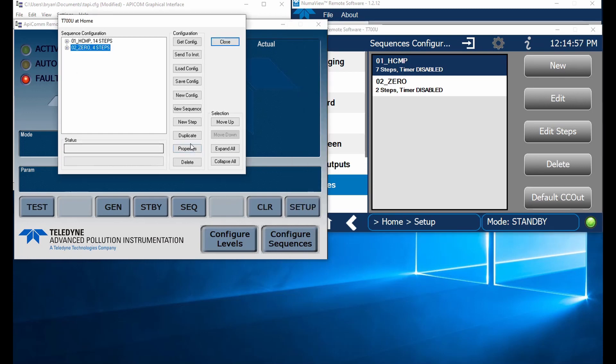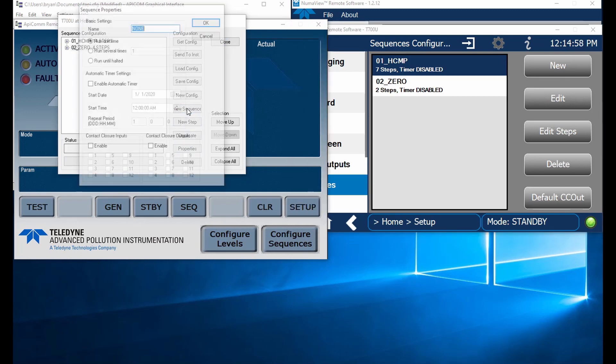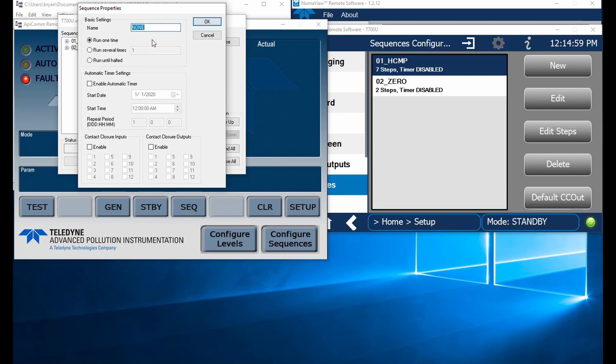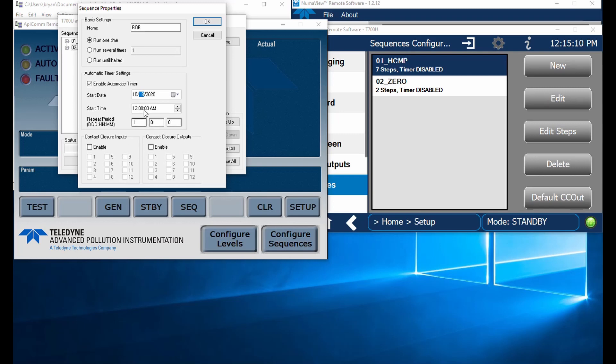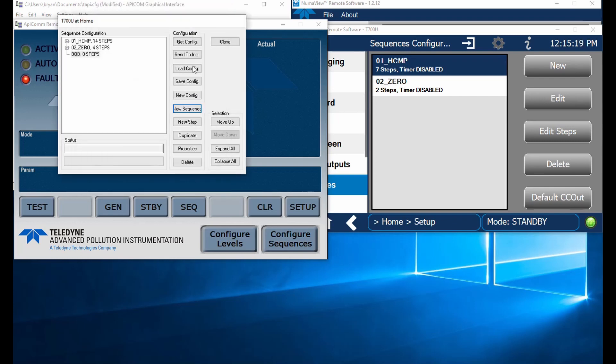Maybe I want to configure a sequence. Let's throw in a new sequence here. We'll call that Bob again. And we're going to say we're going to enable the timer. Let's put this at today and we'll throw it in at 8 p.m. here. So we're going to enable that timer and we're going to repeat every one day.